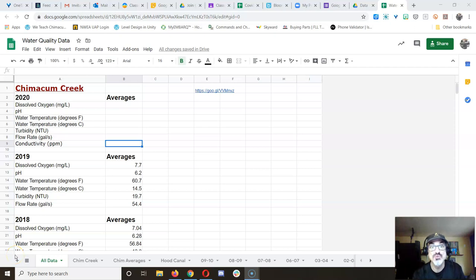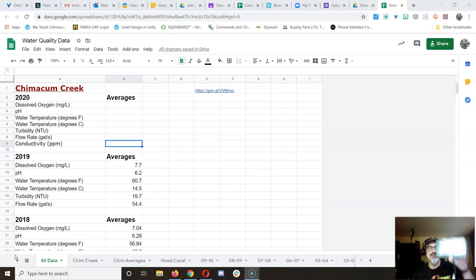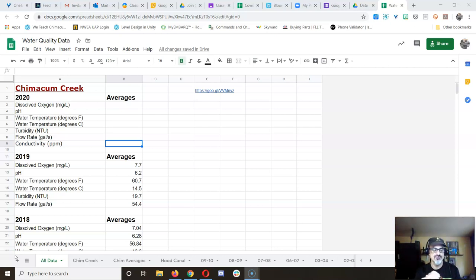So here's where we record our data. This spreadsheet, I've got my lab quest. I go to file, open, and all the files I got yesterday are here.